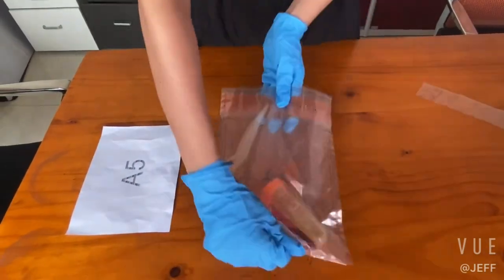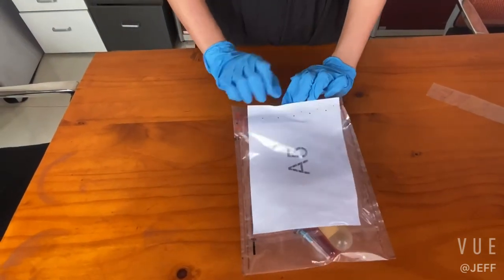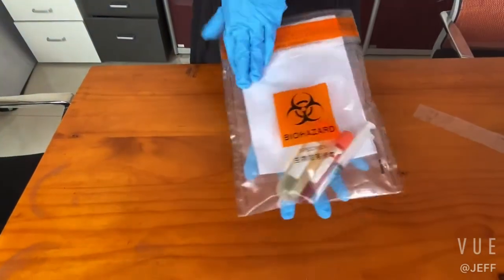Now put the relevant documents into the bag pocket, which helps check the biohazardous materials information during transport.